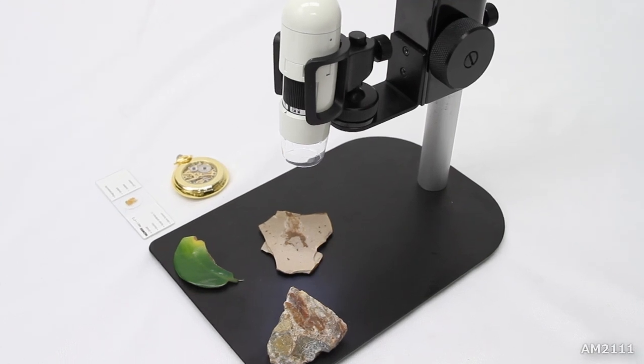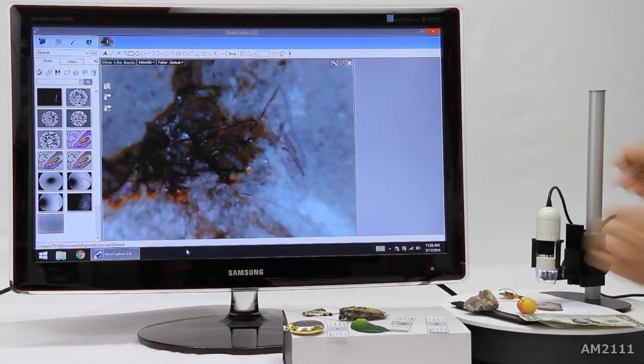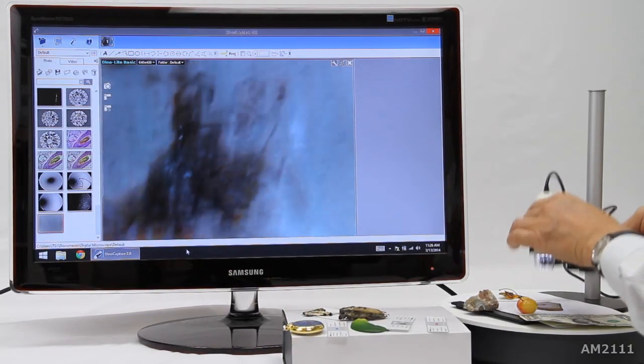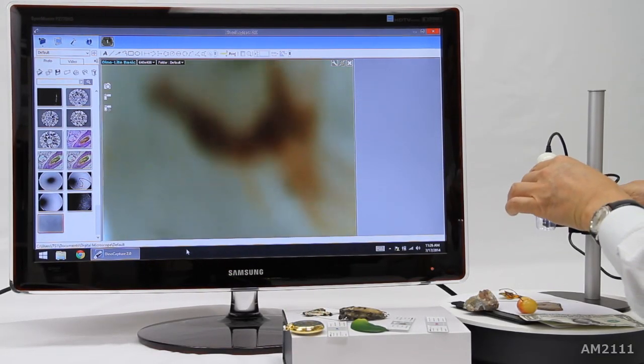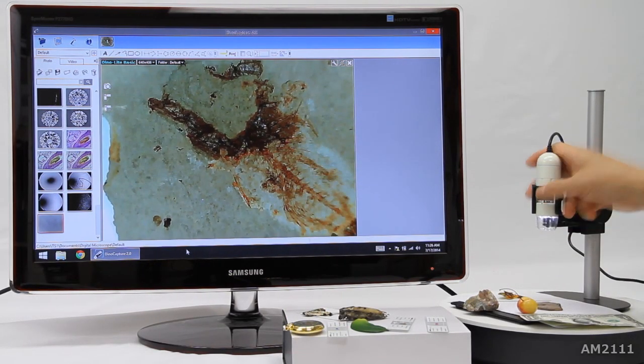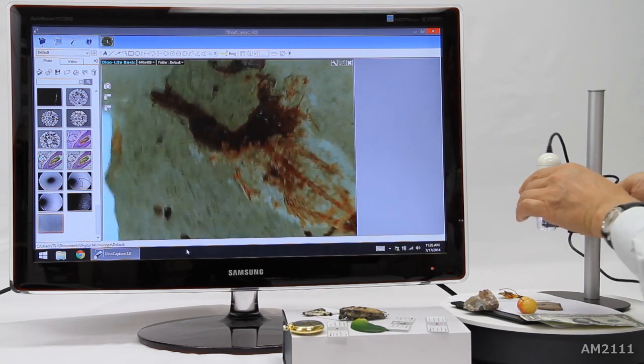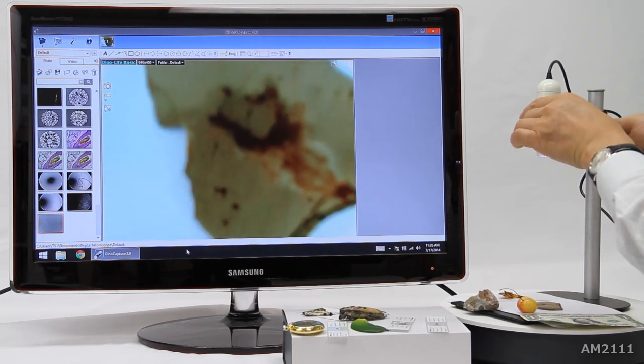Here the AM2111 is shown with the MS35B stand, adjusting the height and magnification with ease.